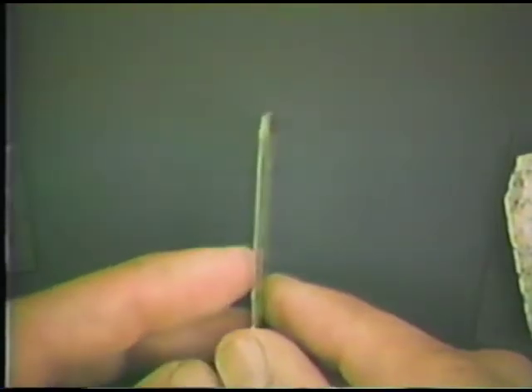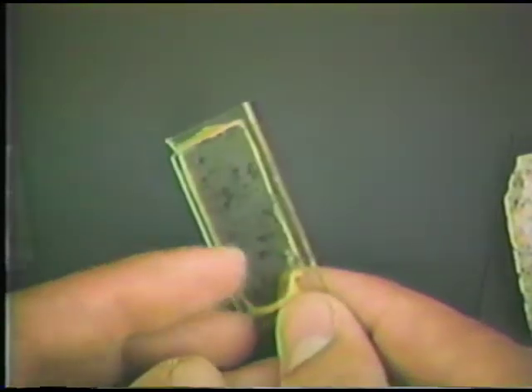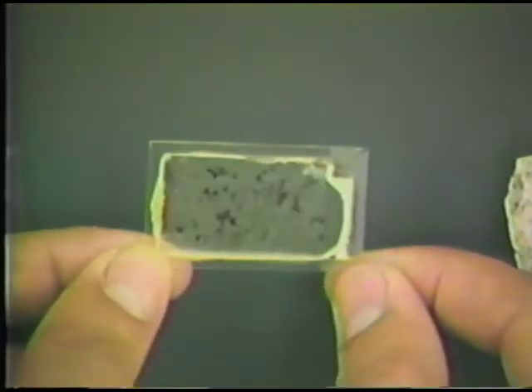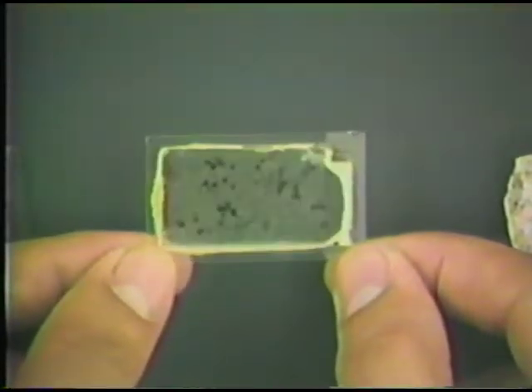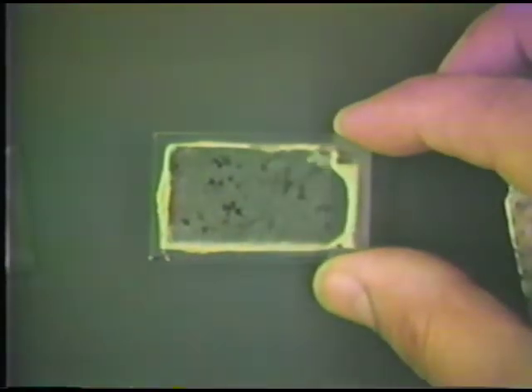So we have a very smooth upper surface, a smooth lower surface from the glass slide itself, a very thin rock specimen, and a kind of sandwich in between layers of epoxy. This is a normal preparation of a thin section, and it's the standard way really to look at the mineralogy of rocks in transmitted light.